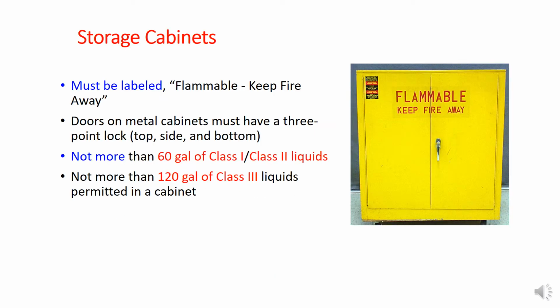Here you can see the yellow flammables cabinets. In most labs, I think in the biology labs, in each lab you can see this kind of storage area. These cabinets are for the flammable chemicals, and of course they must be labeled with a sign that these are flammables. Nobody can keep or bring a fire close to these shelves.